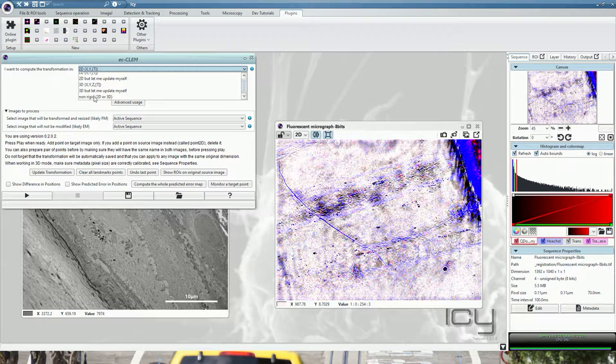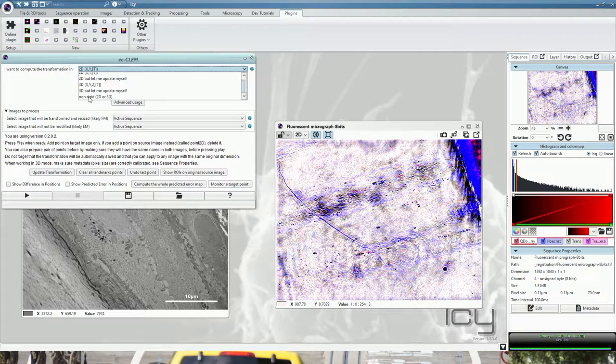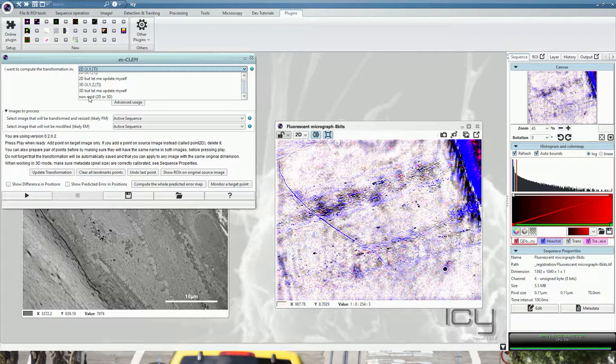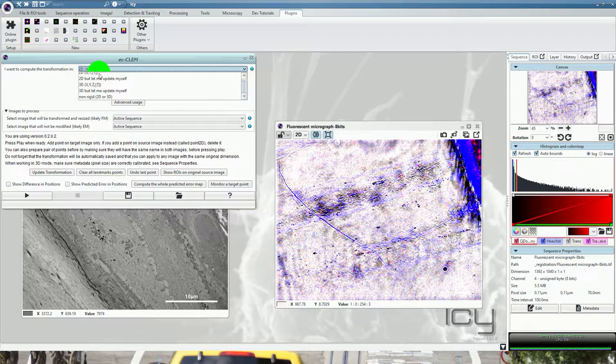Last but not least, you have here the non-rigid 2D or 3D and we will come back to this in a later tutorial. Now, let's start.